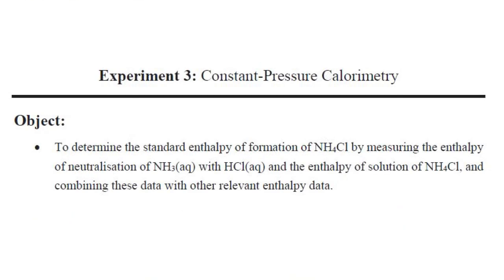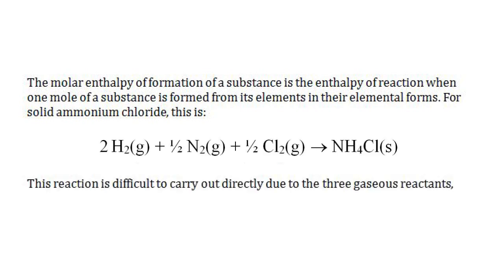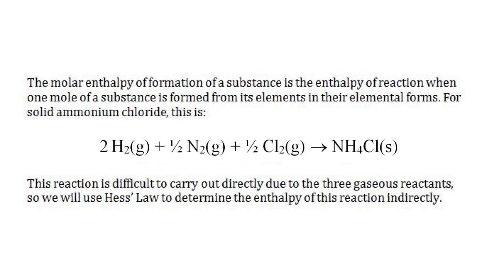The aim of this experiment is to determine the standard enthalpy of formation of solid ammonium chloride. The molar enthalpy of formation of a substance is the enthalpy of reaction when 1 mole of a substance is formed from its elements in their elemental forms. For solid ammonium chloride, this reaction is difficult to carry out directly due to 3 gaseous reactants, so we will use Hess's law to determine the enthalpy of this reaction indirectly.